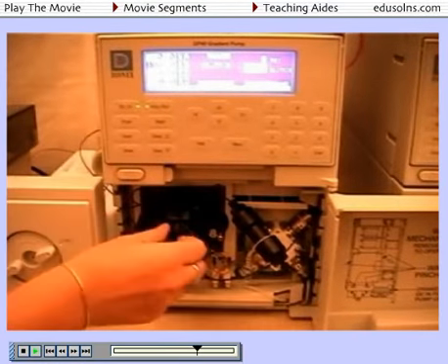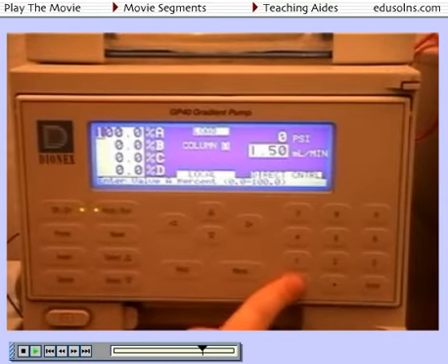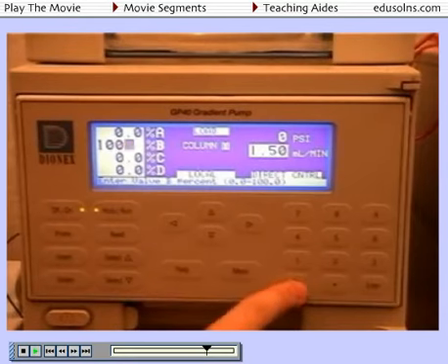If you have more solvent reservoirs that will be used, repeat the process. First, you must switch from solvent A to solvent B on the pump control panel. Again, open the bypass valve and press the prime button. Note the gas bubbles exiting the system. Each priming step will take approximately 30 to 45 seconds.